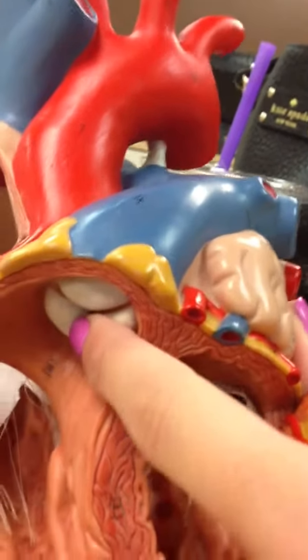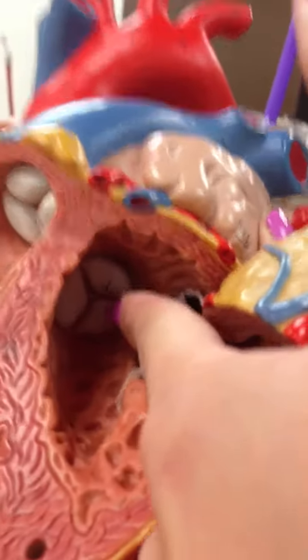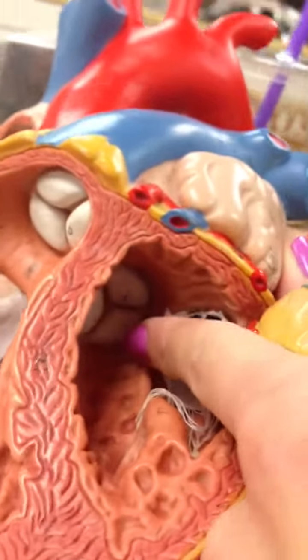And then you have your aortic valve. So your aortic valve is inside, which is right in here. And you can easily tell that because this is your aorta. So it runs right through to the aortic valve.